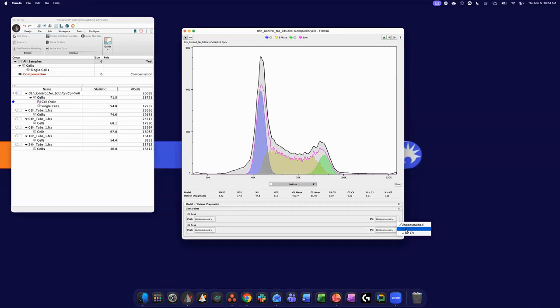If you change it to N, you'll have to manually input these CV values. So if you want to keep tinkering with that coefficient of variation, you can. It'll start at 1 and you can keep changing that value, and the value you're manipulating is here. Now it defaulted to 1. Before, I think it was closer to 9. So I start back there and I get closer to where I was before.